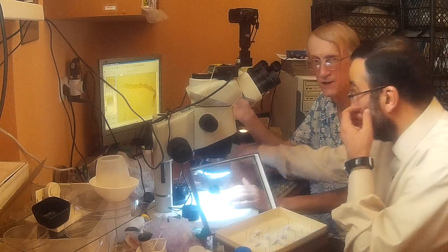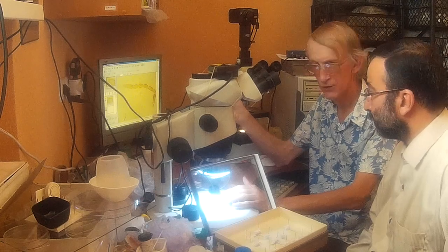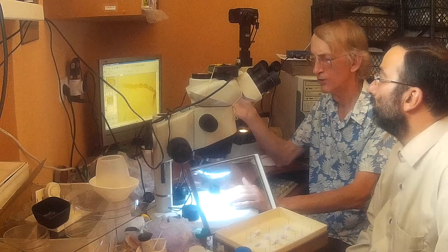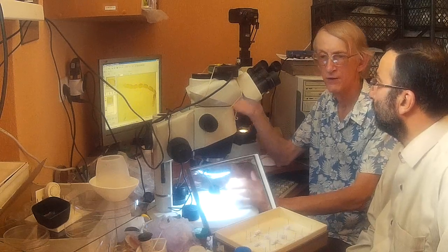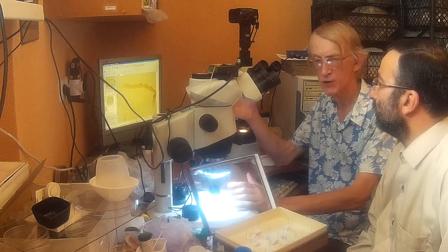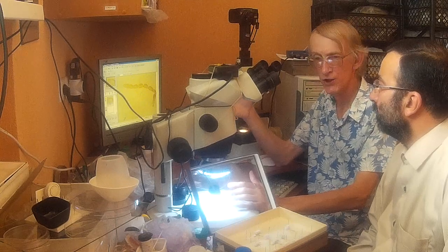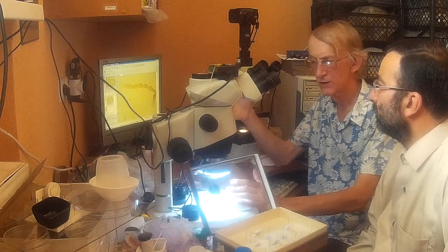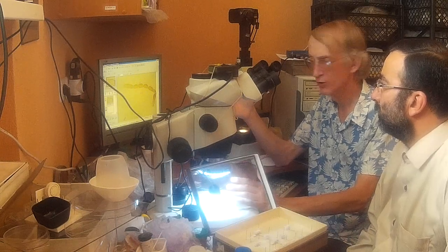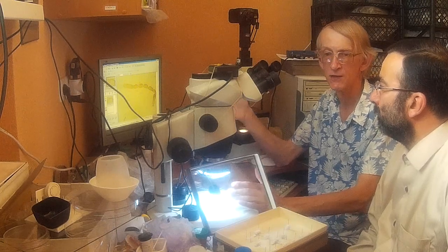For example, this is a picture of a male of Eurytoma, a new species for the fauna of Ukraine. We also used a special collection from our institute, which was collected by our chief and supervisor, Professor Dr. Zerova. She is an expert and worldwide-known specialist on Eurytomidae family taxonomy. Under her supervision, we made this study of the systematics of Eurytomidae.